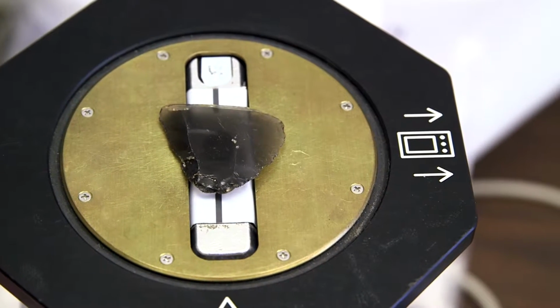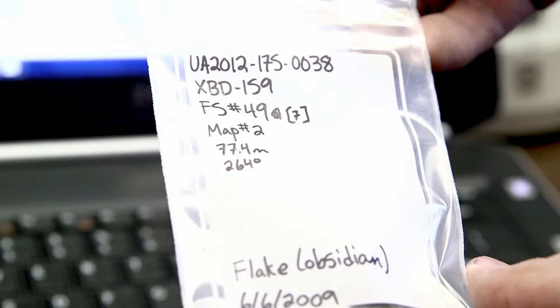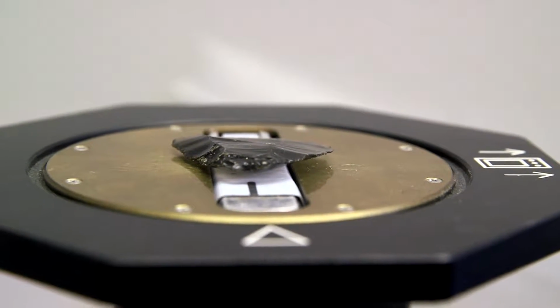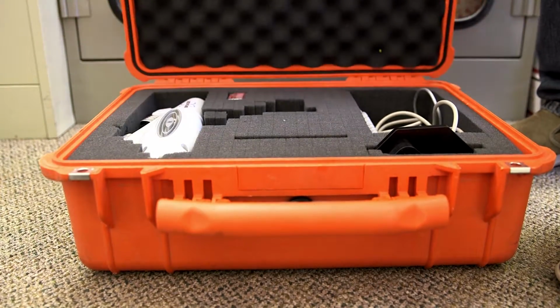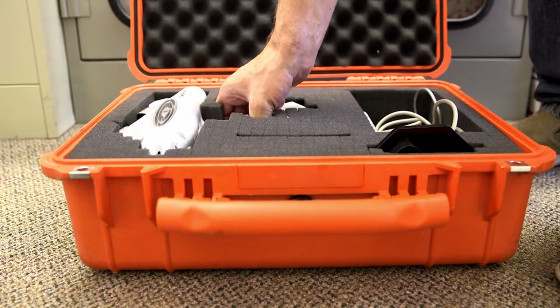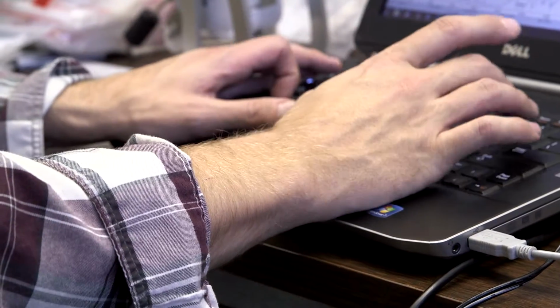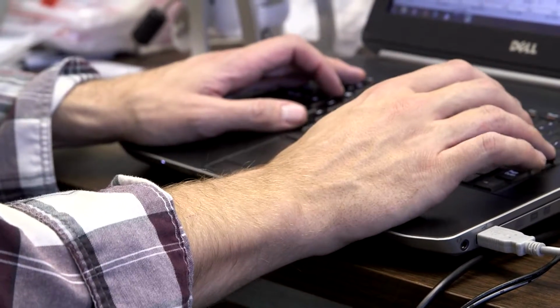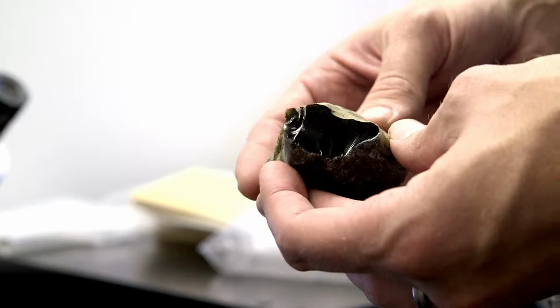This is a flake from Quartz Lake, Alaska. It's made out of obsidian, and we want to understand where the obsidian came from geologically. We use X-ray fluorescence to characterize the amount of trace elements such as nickel, copper, strontium, and rubidium that are contained within a material. Determining the chemical composition of these materials may help us identify what the material actually is or where it originates from.